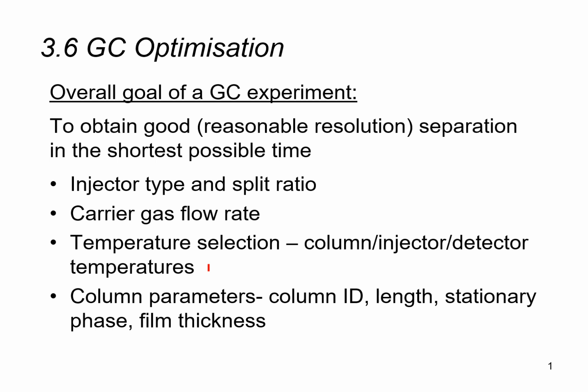Do recall that the column sits in an oven, which is a temperature controlled environment, and the temperature directly affects the rate of elution of various chemical components. So that is going to directly affect the resolution that we observe. And these were some of the column parameters that we also talked about: the size of the column, length of the column, film thickness, and things like that.